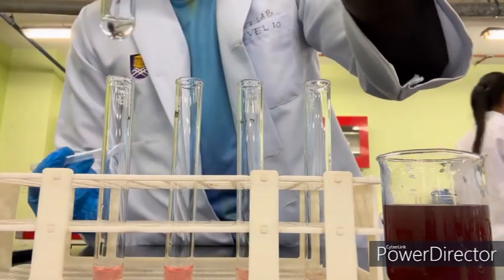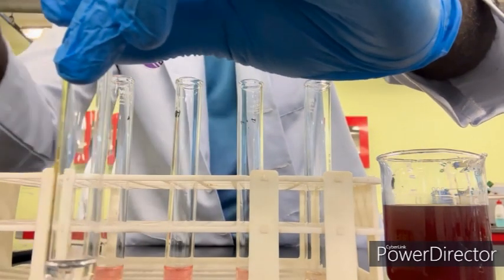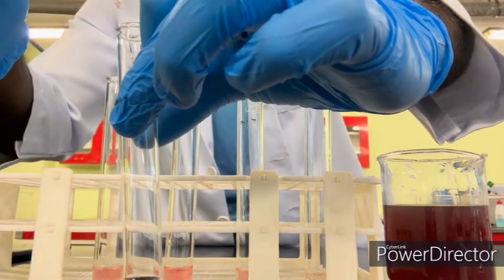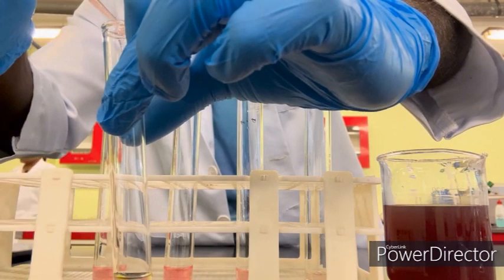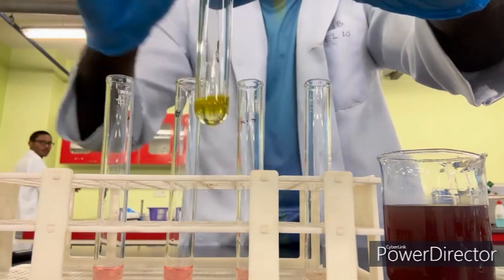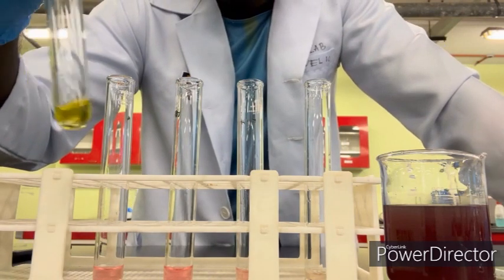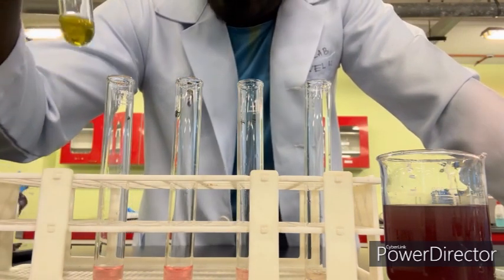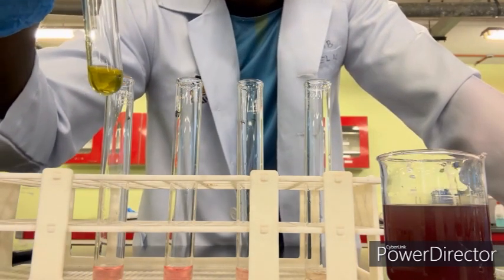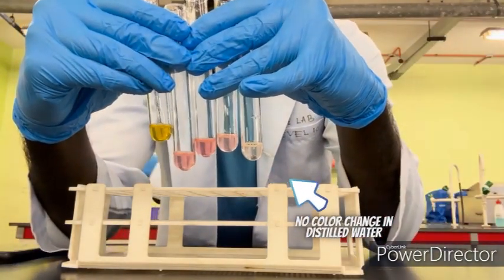And lastly, I'm going to add the solution to the 1 M NaOH. Okay, I'm going to add a few drops. Okay, so these are the changes for the 1 M NaOH. Once we added our solution, we can see there's a yellow color change for this 1 M NaOH. So this is the result once we added the solution to our chemicals.